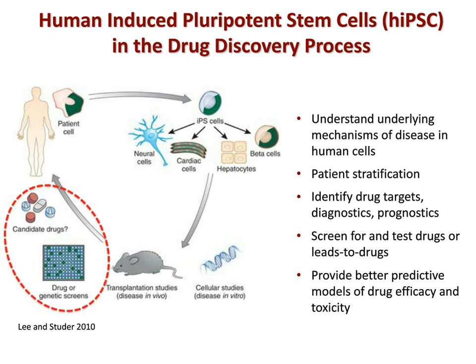So today I'm going to present preliminary results from a very fruitful collaboration between my group at the Prebys Center in San Diego, Dr. Uli Bruckel's lab at Wisconsin Medical College and Cellular Dynamics International focused on using iPSC-derived cardiomyocytes to study left ventricular hypertrophy, a step towards one of the ultimate goals of iPS technology, to use the cells to model complex polygenic diseases.